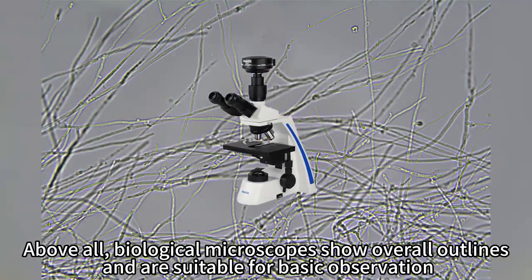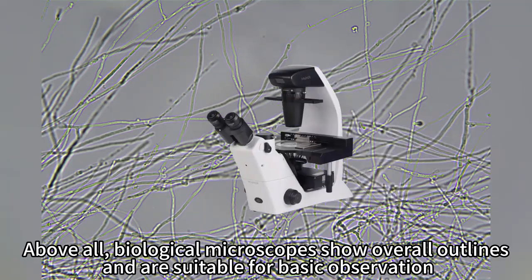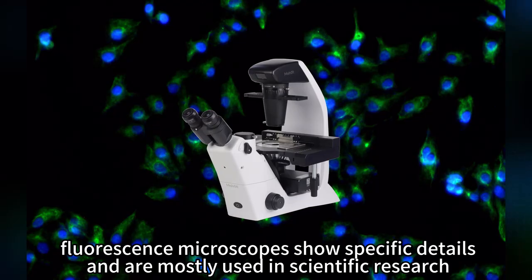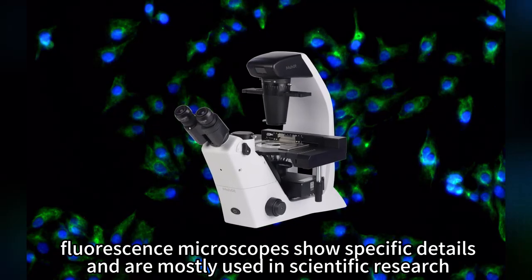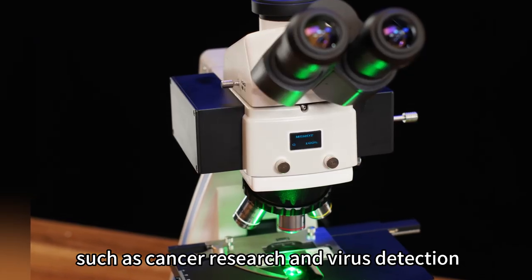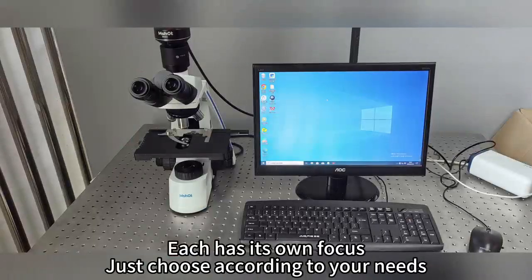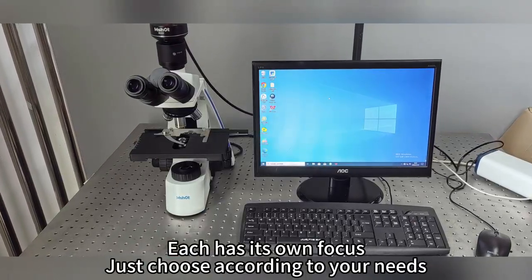Above all, biological microscopes show overall outlines and are suitable for basic observation. Fluorescence microscopes show specific details and are mostly used in scientific research, such as cancer research and virus detection. They are more complex to operate and have higher costs. Each has its own focus, just choose according to your needs.